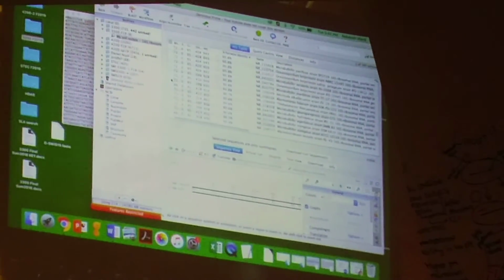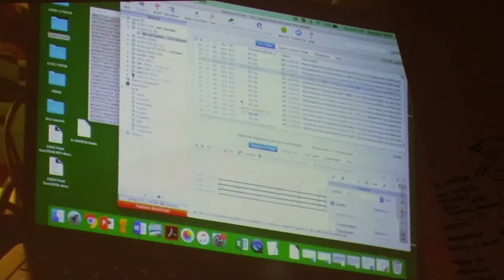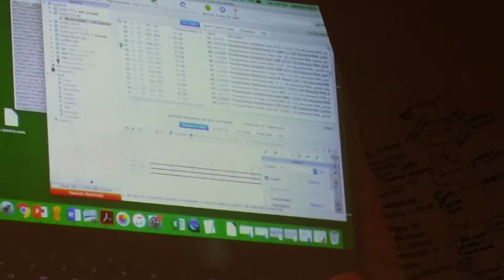What am I going to do here? I'm going to select the ones I want and then drag and drop. I'll select one that's 98. How about one that's 95? One that's 90, 89. You just pick whatever you want, all the way down to about 88. Let's see how many sequences that is. Just put check marks. No, not for all of them. We want 10.